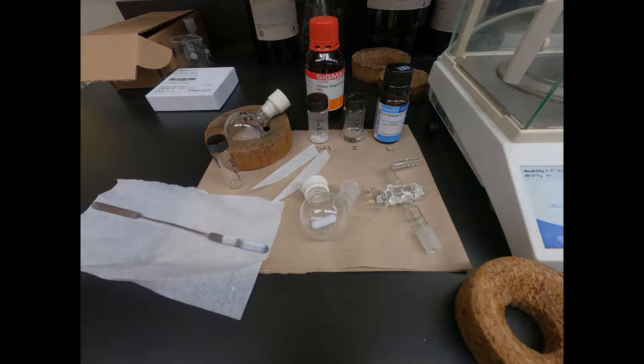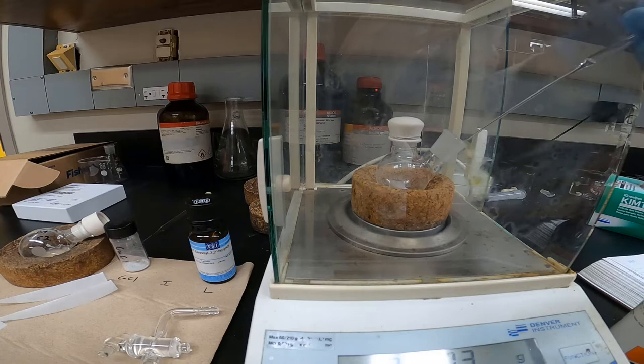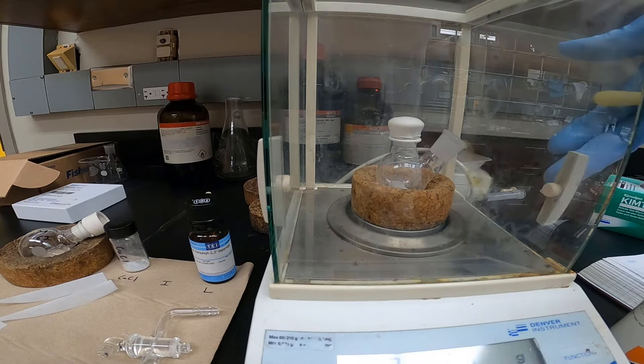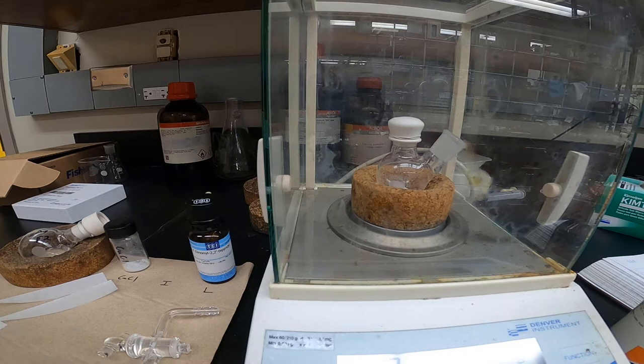Prior to going into the lab, I calculated the amount of each component needed and wrote those values in my lab notebook. I first added the initiator. Since I only used a few milligrams in this example, I prepared a stock solution in anisole with a known concentration. That way the amount of initiator added is more reliable and easier to reproduce.